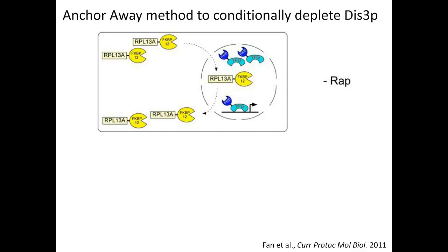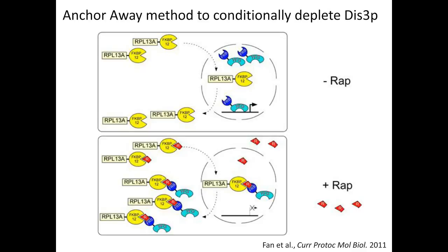In the absence of rapamycin, its ligand, there's no interaction between the FKBP12 subunit of RPL13A and the protein of interest. However, in the presence of rapamycin, the protein of interest, tagged with the FRB binding domain, rapidly forms a complex with the FKBP12, and this is a very stable complex that results in the export of this protein into the cytoplasm. This method has been shown before, and we thought with the QuantSeq method we could multiplex many samples using mutants modified with this method.